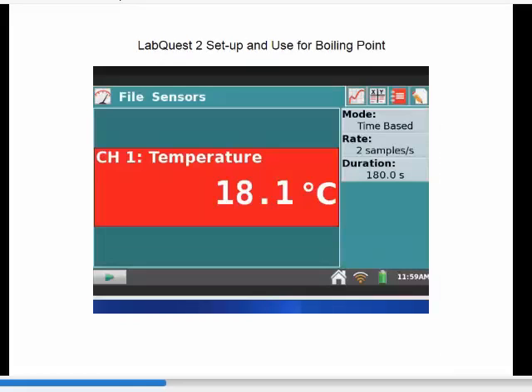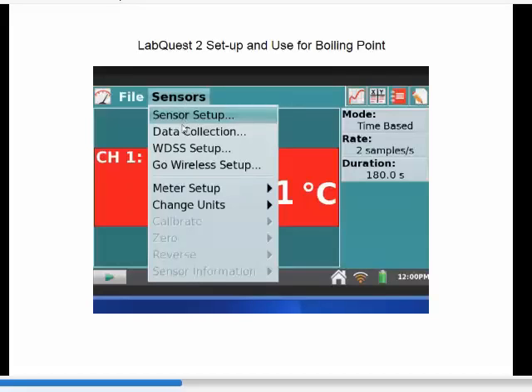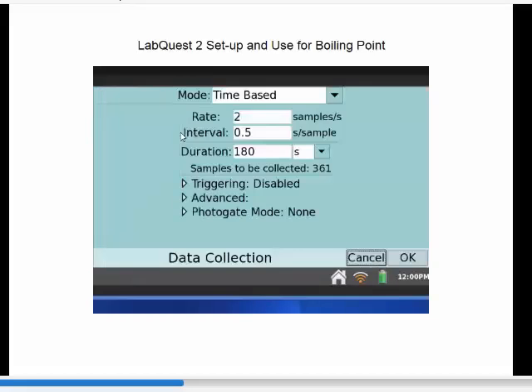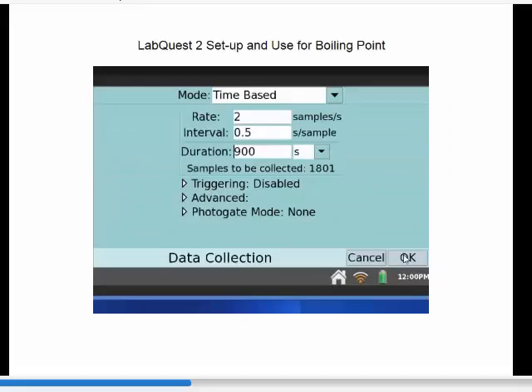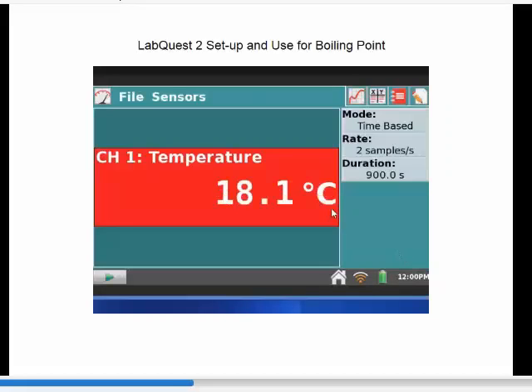I'll take a quick minute and show you something about setting up the LabQuest. Initially, when this comes up, it's going to be set to take data for three minutes and then quit taking data. This will probably take you longer than that. So we need to reset that to be longer than three minutes. To make that setting change, you go up to where it says Sensors, click on Sensors, come down to where it says Data Collection. And then I can click on where it says 180 seconds and instead of 180, I'll put in something like 900 seconds, which is 15 minutes. Tell it done, tell it okay, and that setting's complete.